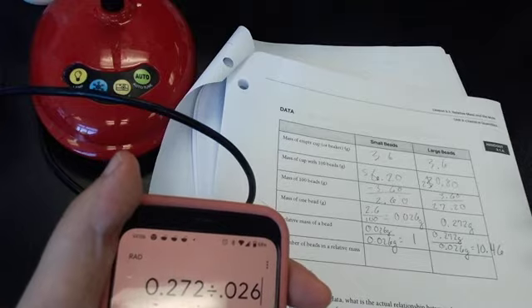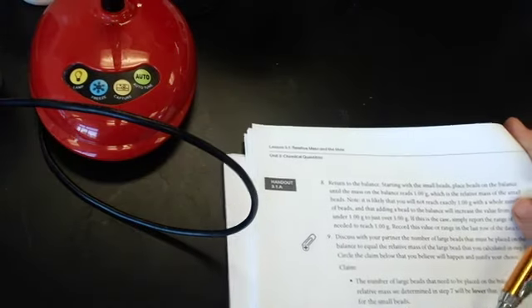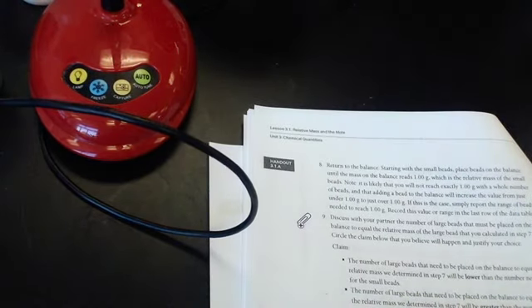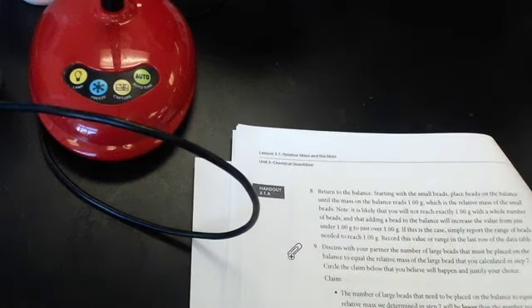Okay, all right. So then we need to read instructions again. Return to the balance. Starting with the small beads, place beads on the balance until the mass of the balance reads 1 gram.